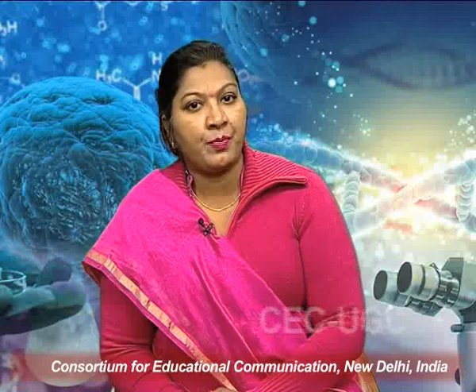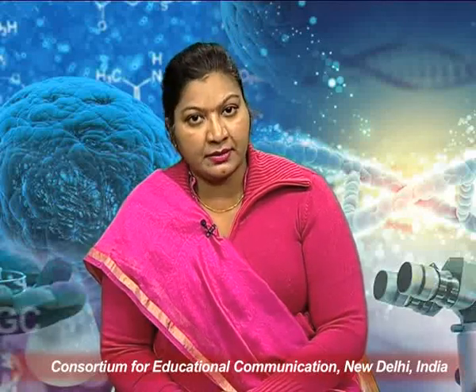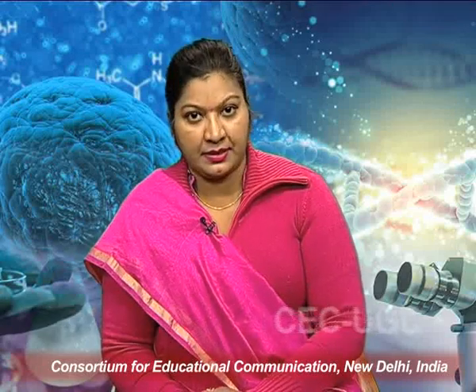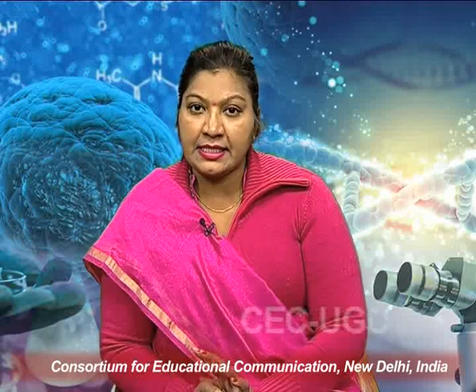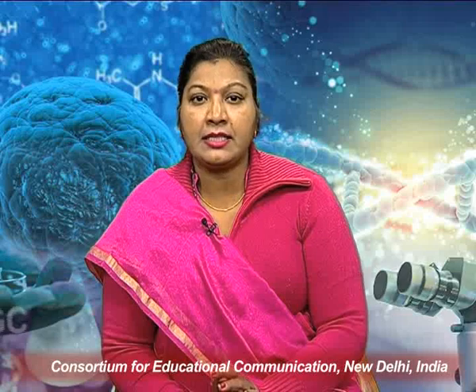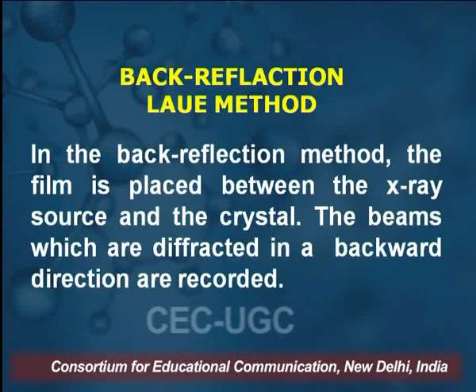Now the Laue method is divided into two parts. First is the back reflection Laue method, and second is the transmission Laue method. In the back reflection Laue method, we see that the photographic film is in between the X-ray source and the crystal.